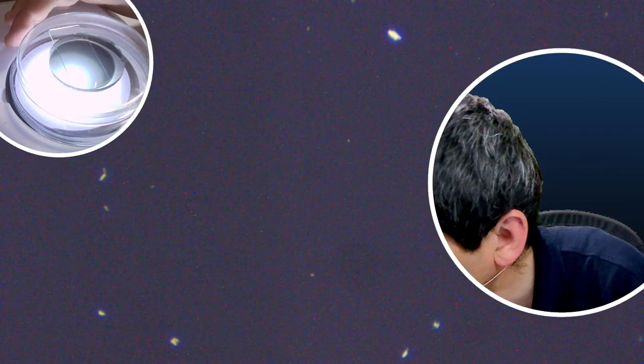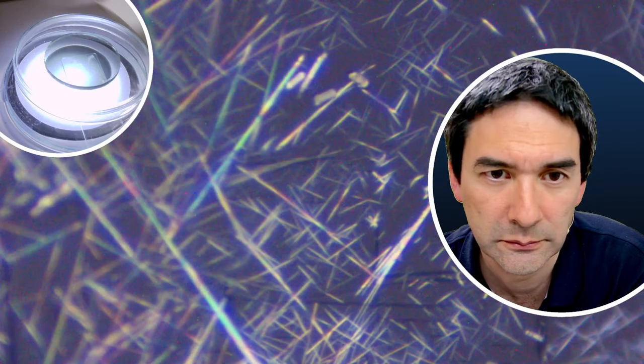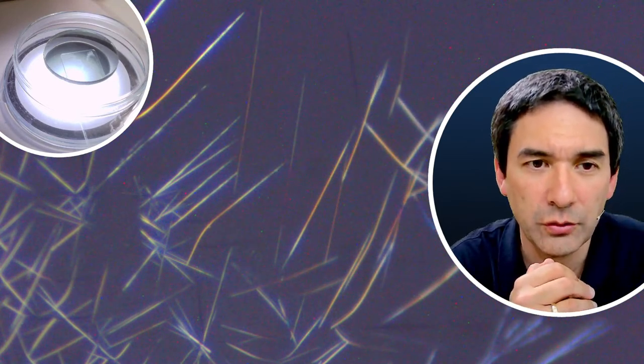Okay, essentially it's indeed some kind of overlap of crystals that you have here. So let's see here again. Let me see this here. I'm going to move this a little bit. Okay, so I got the edge now where you have again crystal growth happening.